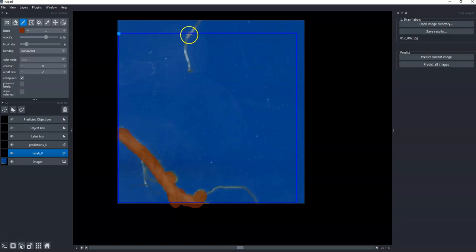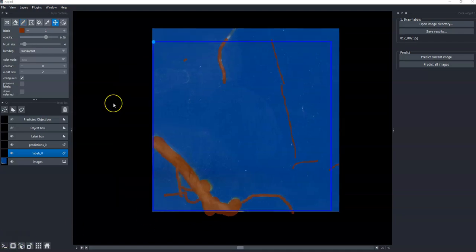So these ones I'm mostly just testing the wiring, and this one was probably a little too thin, so let me make this guy a little thicker. And one more to do. Maybe I'll just pause it for a second here.